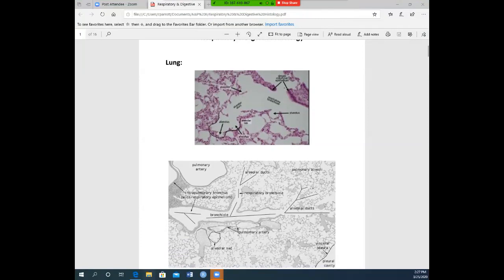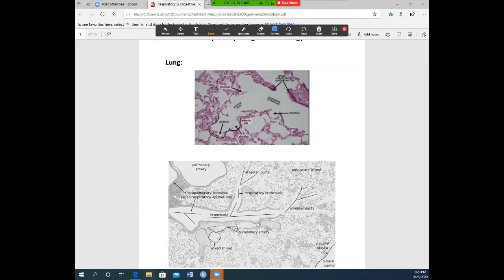If asked on a practical to identify this organ or gland, you would put lung. There are a few structures to be aware of. This large long tube is your bronchiole, and it leads into the alveolar ducts. At the end of the alveolar ducts are large pockets called alveolar sacs, and each tiny bubble at the end is called an alveoli or alveolus.